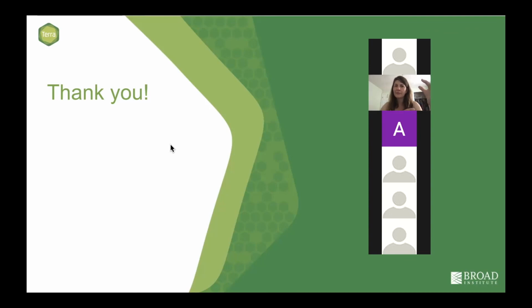And that's the whole point, because if you're doing an analysis and you want to share that exact same analysis with your colleagues, you can do that. And you don't have to worry about it, because you're literally giving them the same software dependencies. You're just pulling it from the cloud. It's in a repository in the cloud.